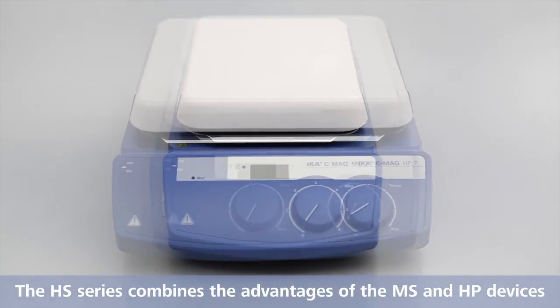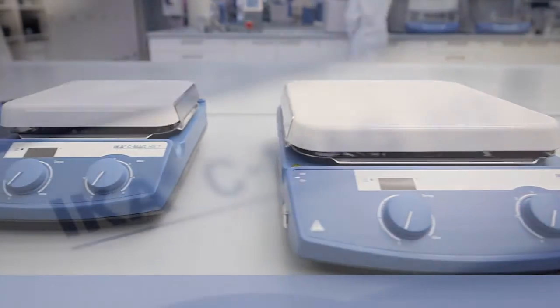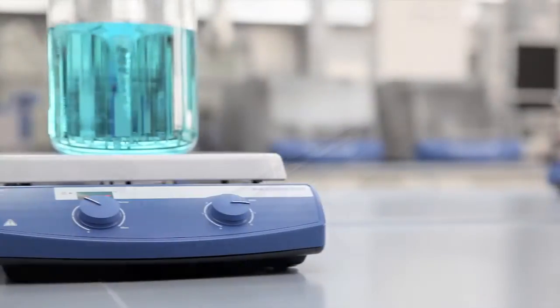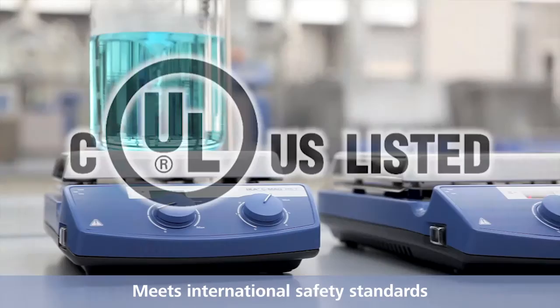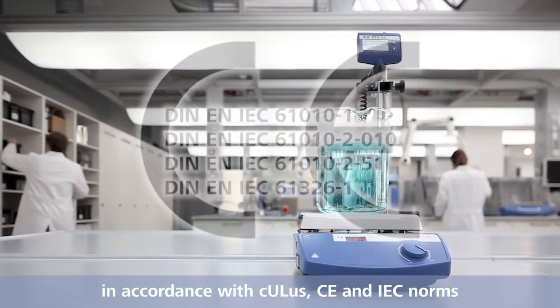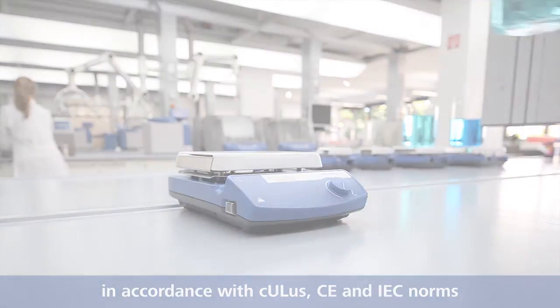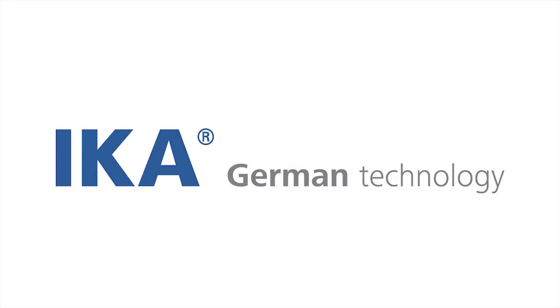The HS series combines the advantages of the MS and HP devices into a powerful magnetic hot plate stirrer. The devices of the IKA C-MAG series meet international safety standards. They are in compliance with cULus, CE and IEC norms. IKA — designed to work perfectly. German technology.